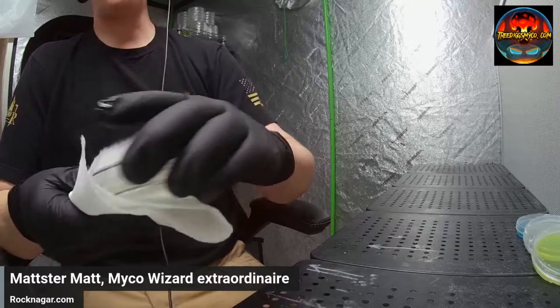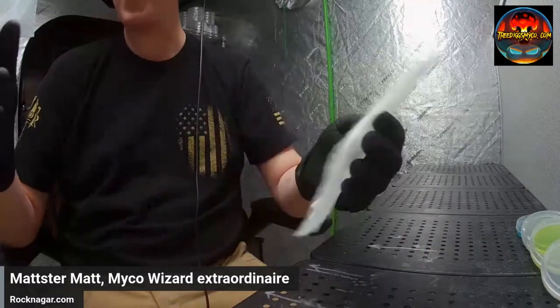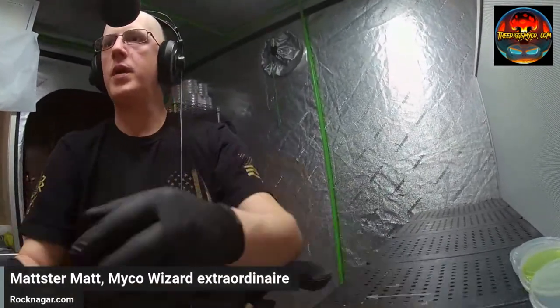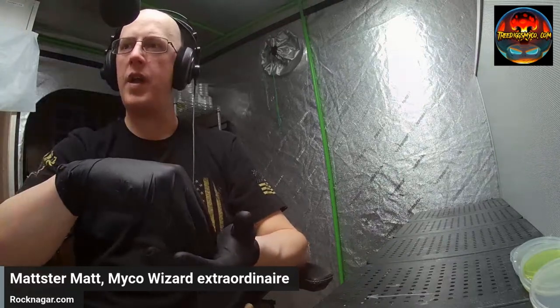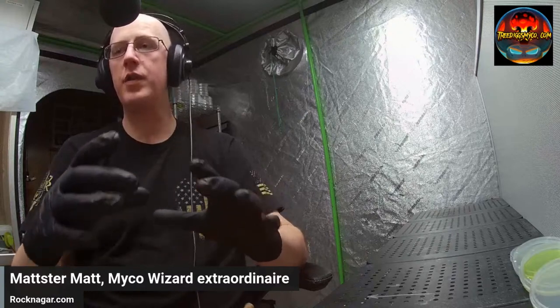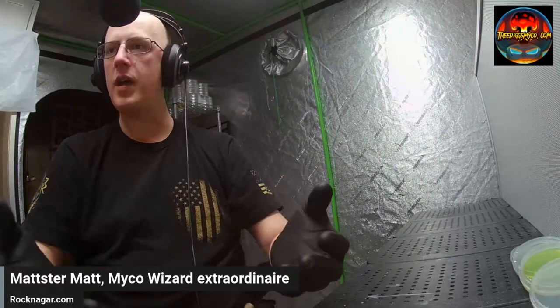What I learned from the last experiment was that you don't actually need all the fancy cutouts that I thought you did. I cut out a trench for the mushroom plate, but you actually don't have to remove a trench. You can just take your scalpel and cut a line. Then the mycelium hits that line and dives down into it. Just by its nature, because it's more concentrated there, it appears as if there's a solid white line. So it'll expedite the process for making these fancy designs that I've been doing.